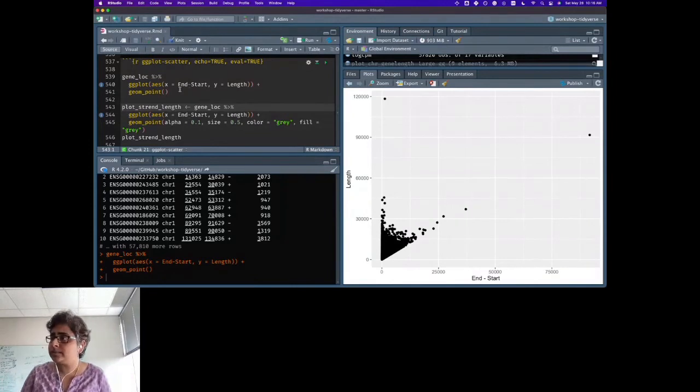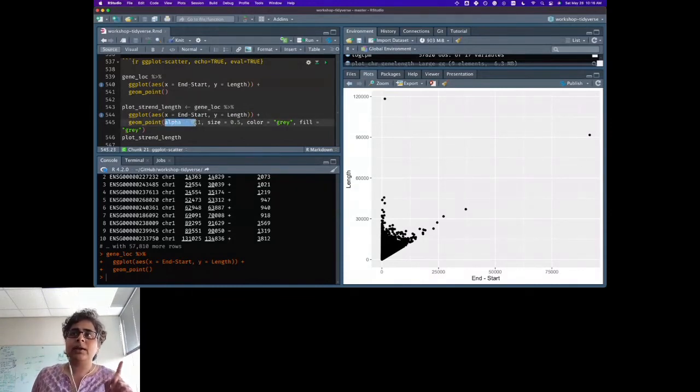Well, it's a plot. There are some patterns. You can see that you have no points here. But it's not very helpful beyond that. You don't even know how many points there are. So we're going to add a few customizations here, few things to make it slightly better. First, I'm adding alpha. Alpha is to increase transparency.